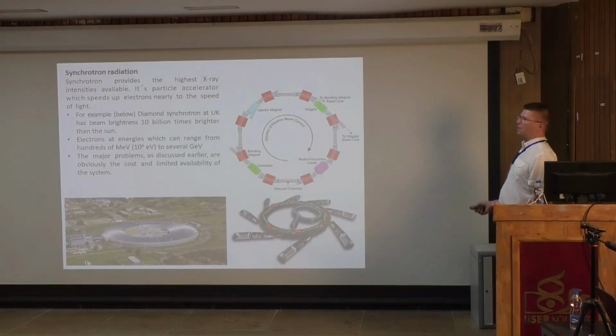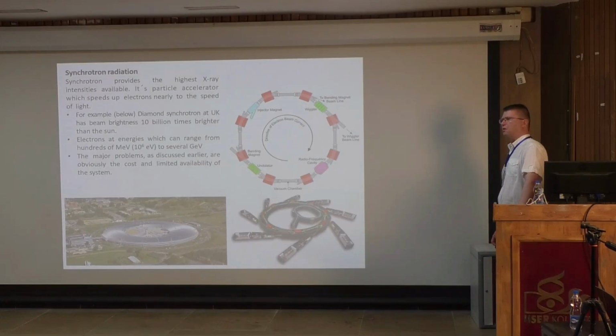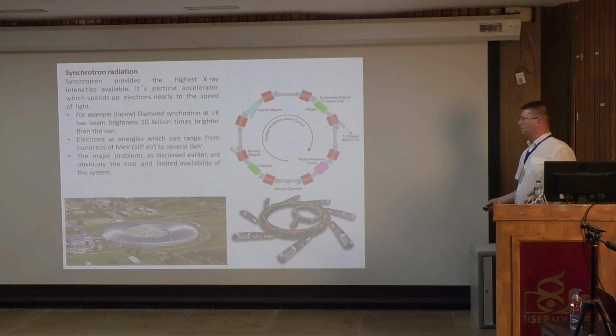And then, of course, finally, the synchrotron radiation, the question of how it's done. So you accelerate the electrons in here, and then you get a huge speed, look here, 10 to the power of 6 electron volts. So that's the speed that is used to do this. They're high energy electrons, and then they create high energy X-rays. But in principle, the wavelength, once it's coming out from here, is the same as in an in-house instrument. But this is the Diamond Light Source here.